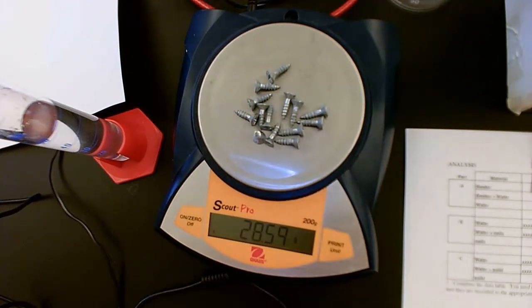The mass of the zinc screws. Make sure you record it. This is part B. It might say nails in your data table, but we're getting the mass of the zinc screws in part B. Make sure you take it to 2 decimal places and make sure you put a label after it.